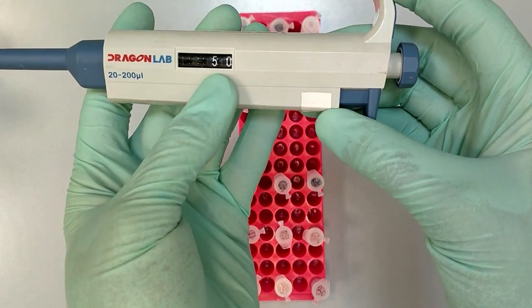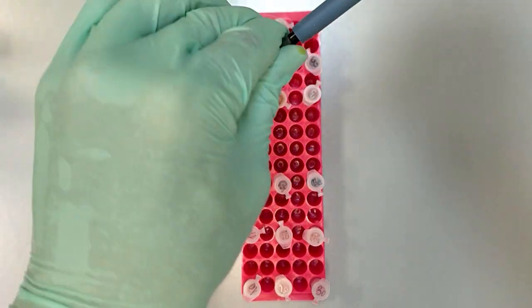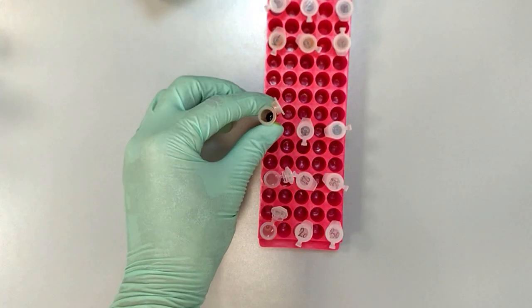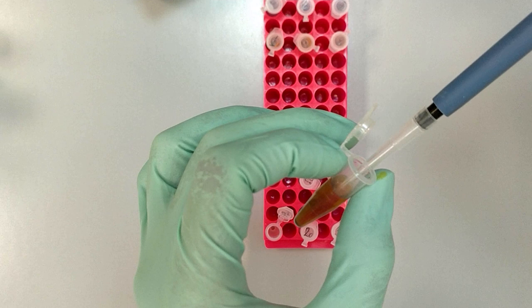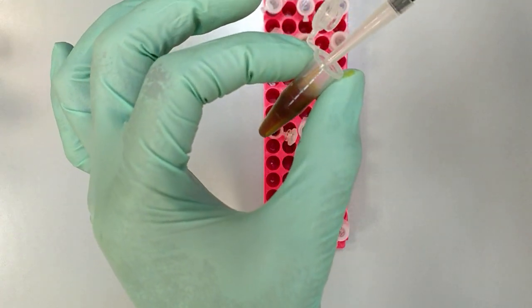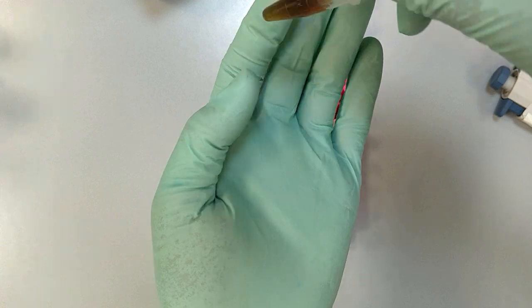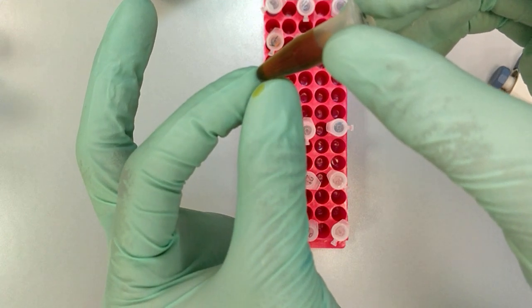Okay, so what we do, we first add the iodine. So again, it's 50 microliters to our first inside and first outside. And when we add it, we can clearly start seeing the sedimentation of the black particles. Unfortunately, it's not very visible on the video, but after some time you will see the sedimented particles here.